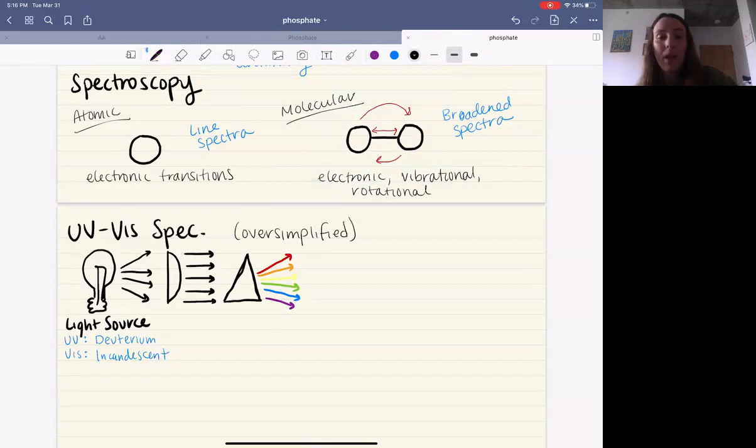Okay. Up next, we want to just pick out one of those wavelengths. So next is a slit, which makes it so that all of the other wavelengths, apart from the one that we want to select out, are blocked. And like in this example, looks like the yellow would go right through.